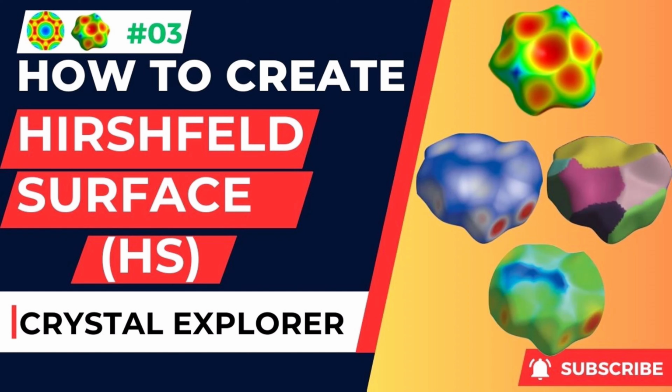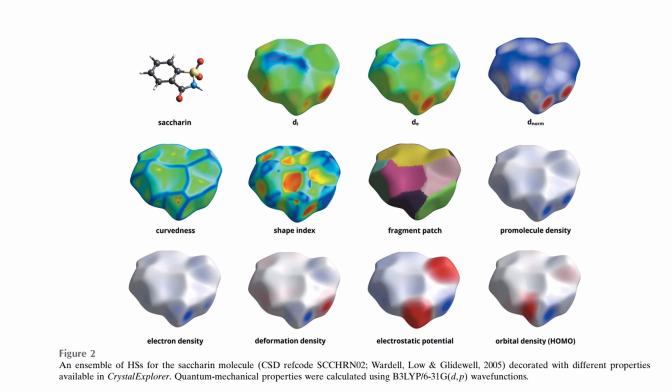In this video, I'm going to teach you how to create Hirshfeld surfaces using Crystal Explorer software. So this is the model system, the saccharine molecule, I'm going to use to teach how to make this kind of surface. Here, they used a saccharine zip file they downloaded from the website and made this kind of surface.